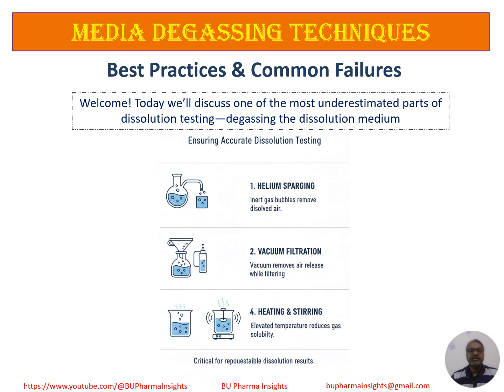Hi everyone, this is the 11th video in our Advanced Pharmaceutical Dissolution Science and Application series. In this video, we will discuss media degassing techniques, best practices and common failures.